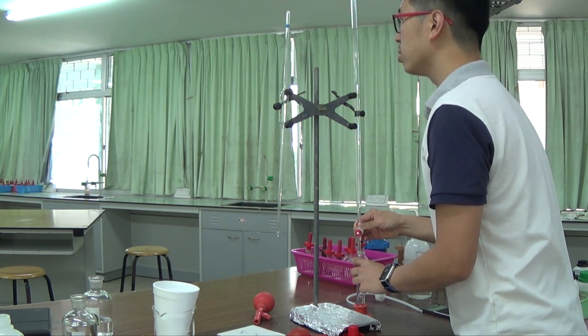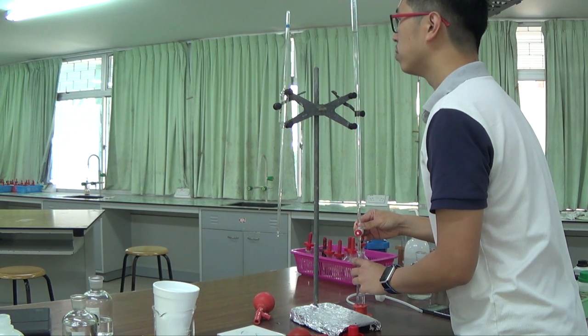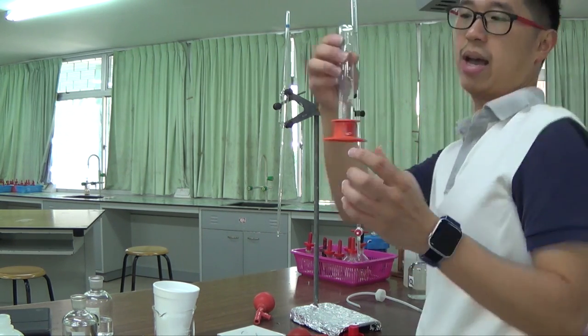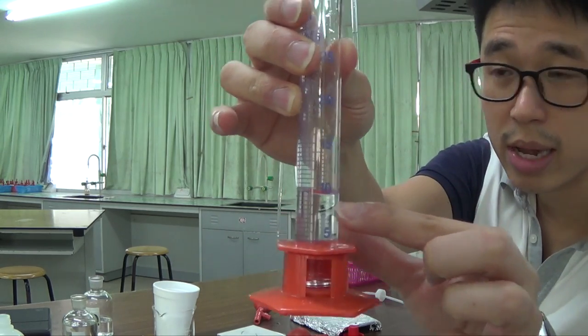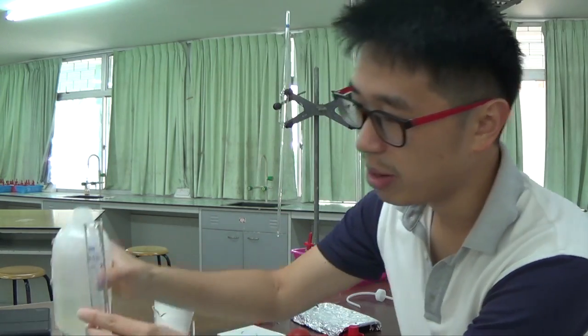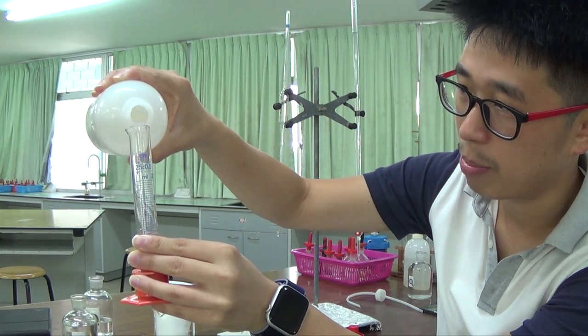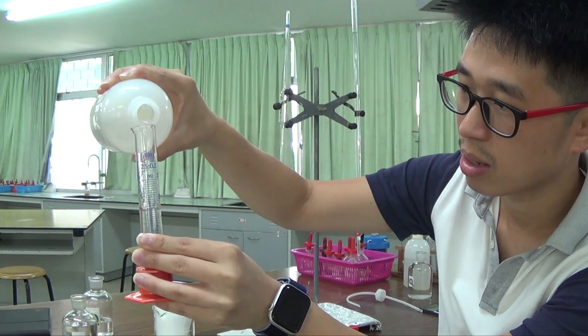So towards the end, you want to do it drop by drop, so you have to be careful. Okay, so that is my 10 cm cube there. I'm going to add distilled water, but again, you don't want to overshoot it, so you have to use a dropping pipette towards the end.